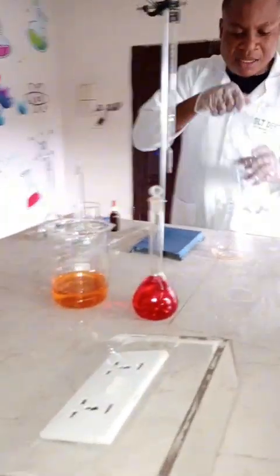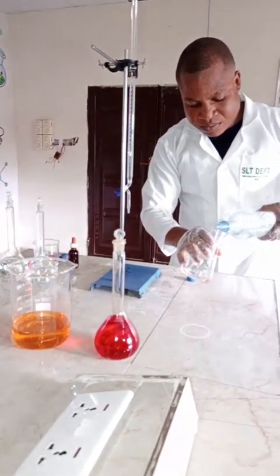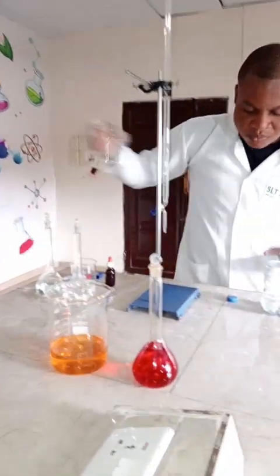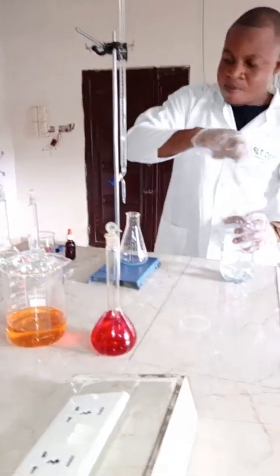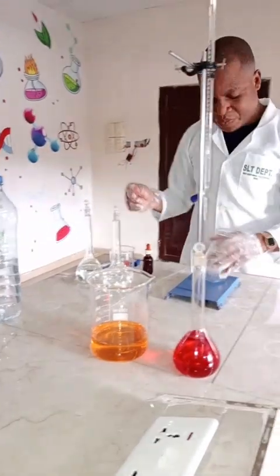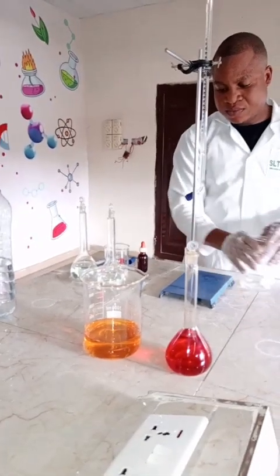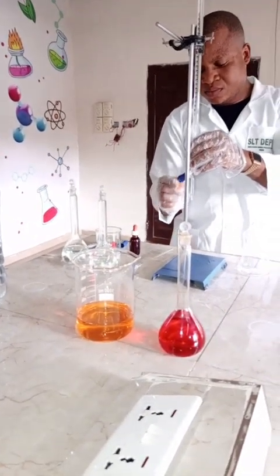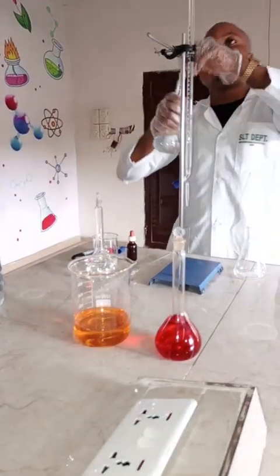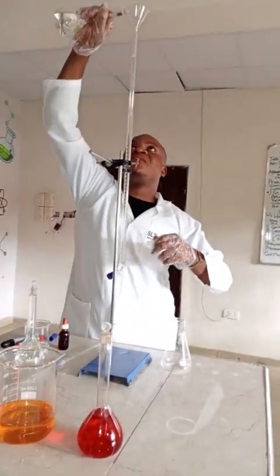Now let me raise my titrating flask. I'm going to fill up again to the 0 mark just for accuracy.